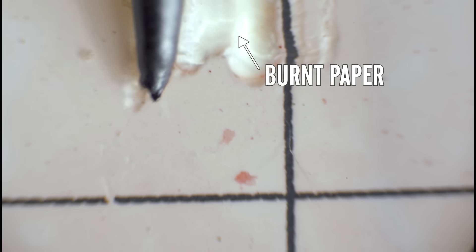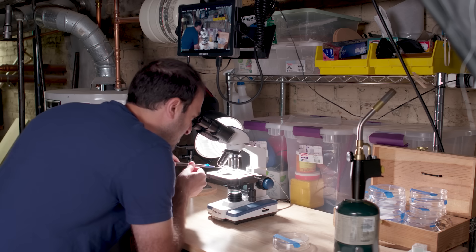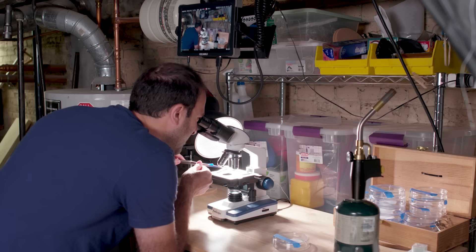The hot needle test is a lot harder to do than I thought it would be, because you're basically using a macro lens or a microscope to guide a tiny needle to less than a millimeter distance from a thing. I messed this up in so many ways. The few tries that seemed okay, I did not see anything melt. But that doesn't necessarily mean these things are not plastic — I think it just means I suck at doing hot needle tests.